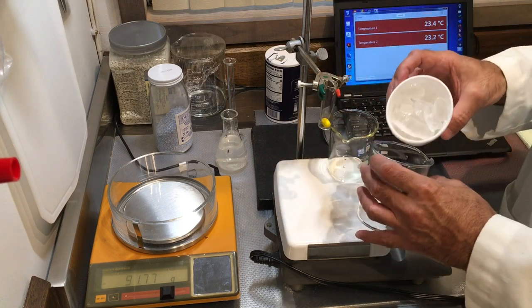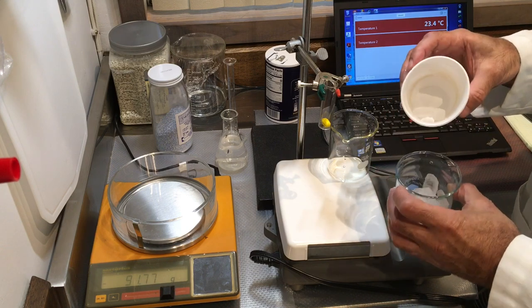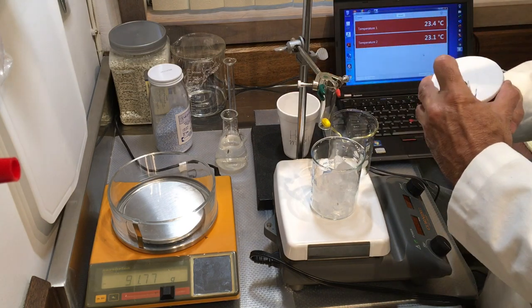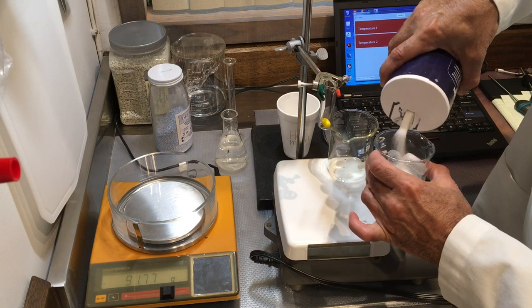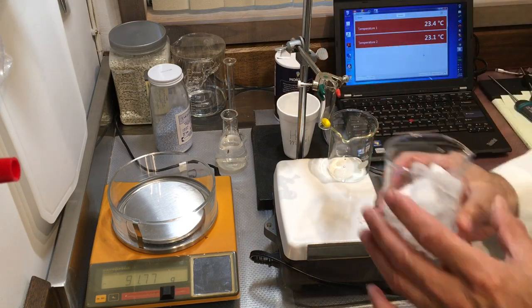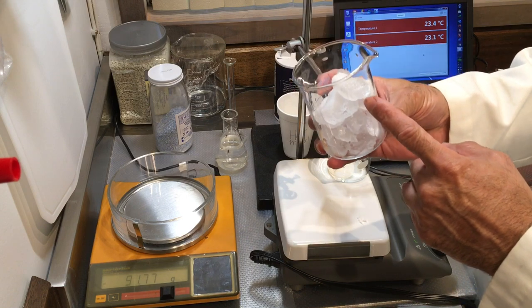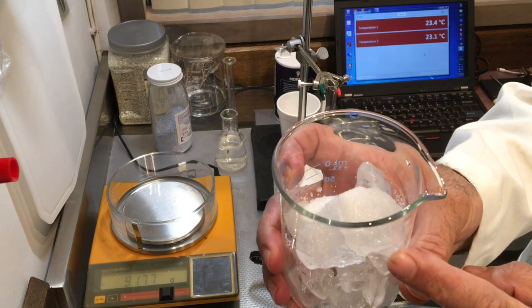I have some ice here, so let's transfer some into the beaker. This is pretty large-sized ice. I'm going to put some salt over it — I'm eyeballing this process and just pouring some salt here. When you put salt over ice, you lower the freezing point — the same experiment we're doing, but in a more pronounced way with larger quantities.